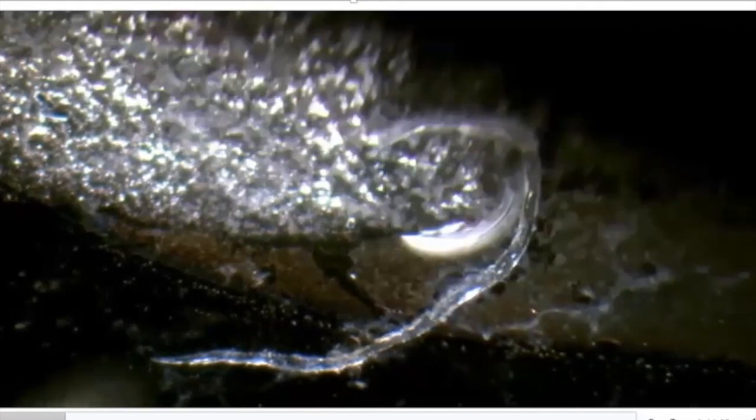And let me just play this video. What I did was I was able to take the cover slip off after adding the MasterPeace, and I used a needle to see if I could somehow prod at this structure, because everyone's observing them. At the tip of the needle was able to be moved.